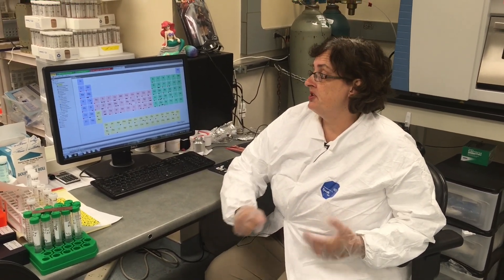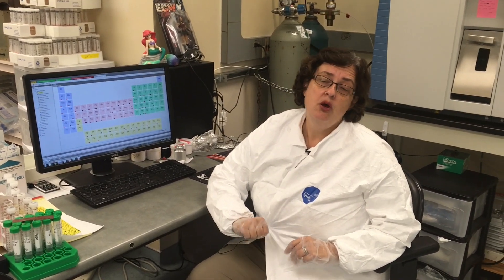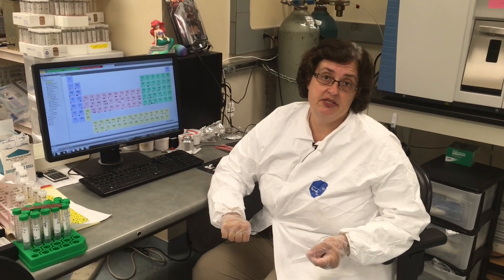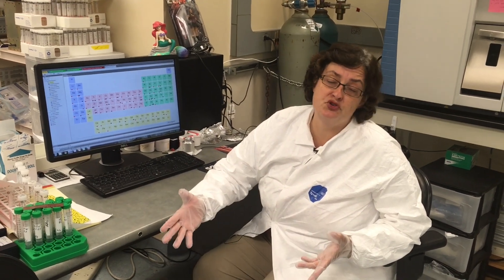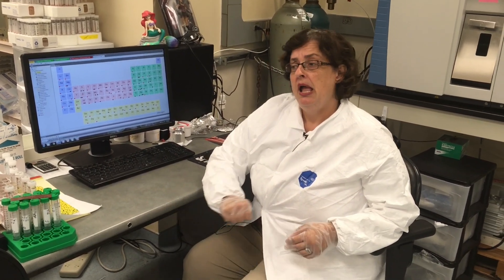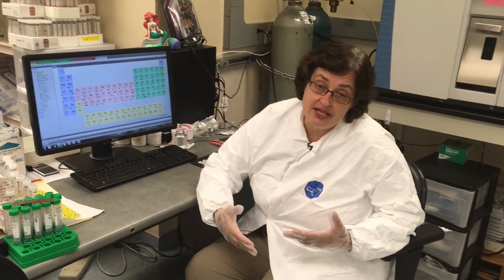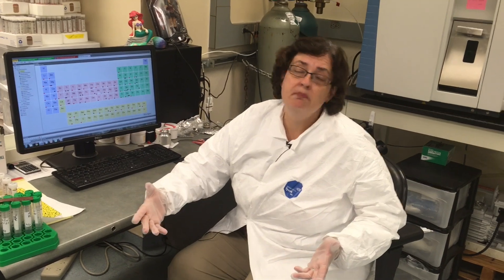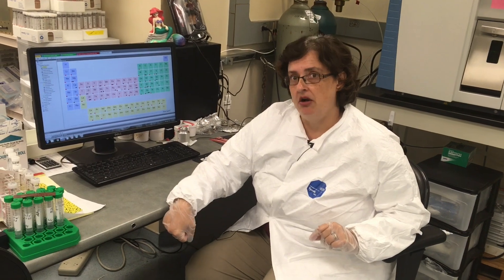We can measure trace elements, transition metal elements, and rare earth elements with very, very low detection limits. For things like uranium, we're often measuring parts per trillion or below — but that's in the solution being measured. If you bring a solid sample to us, we're going to have to digest it and dilute it to get it into a form the instrument will measure. So just because we can measure one part per trillion of something doesn't mean we can measure one part per trillion in that solid material.